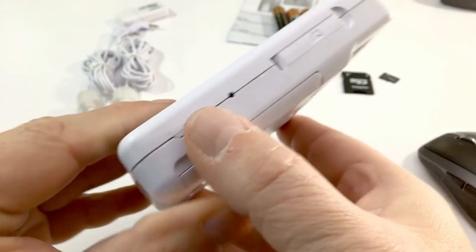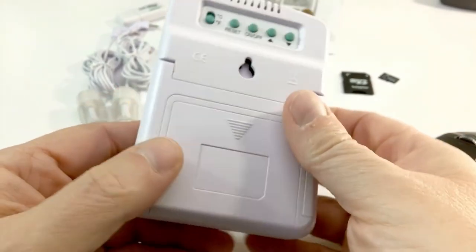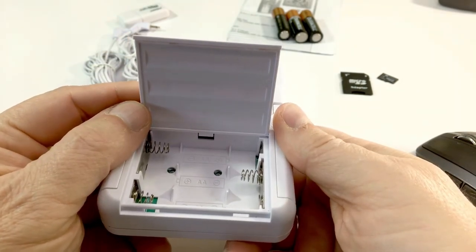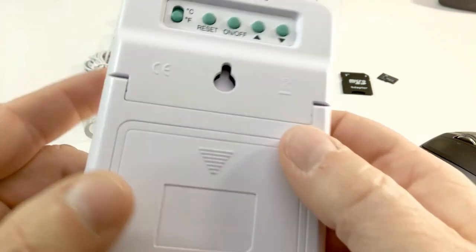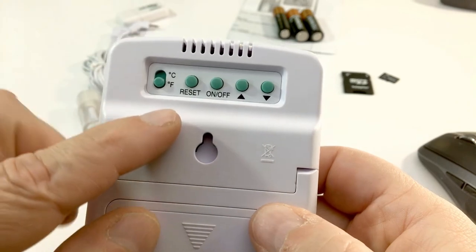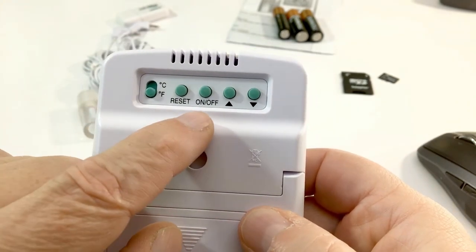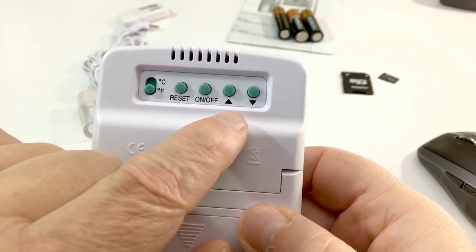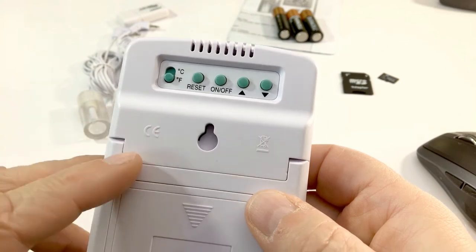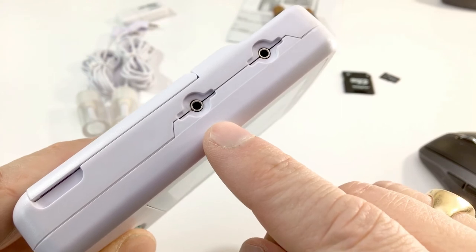On the right side there is also a flip-out desk stand. On the back you have your battery compartment for the three double-A batteries. Up top you have a selection switch for Centigrade or Fahrenheit, a unit reset that sets back to factory, power on/off, and up and down value selection buttons for configuring date, time, and min/max values. On the left-hand side of the unit we have two keyed probe jack ports.